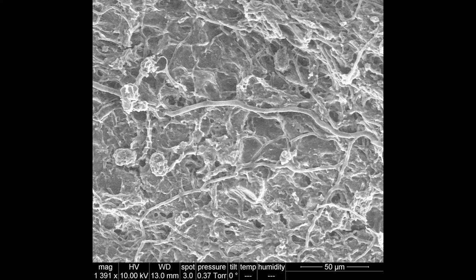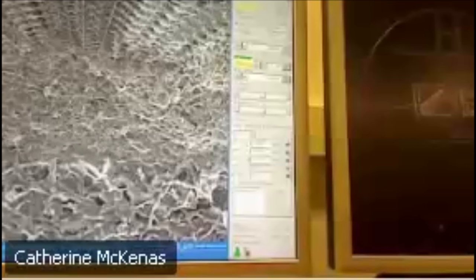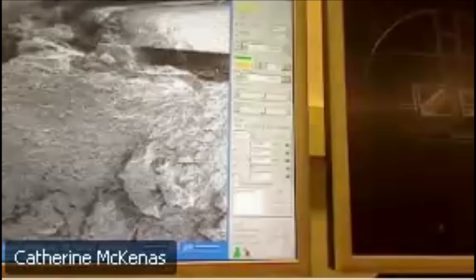So the second layer, once we move over to it, you'll see that it's much more loosely packed. You'll start to see all these outstretched fibers, and it looks kind of creepy a little bit. That area is actually where the fungus thrives. All of the fibers that we'll show y'all are filaments of fungus. So we're gonna move over there, and we're gonna zoom in, and you should start to see all these fibers going every which way. And we'll focus it so y'all can see it a bit better.